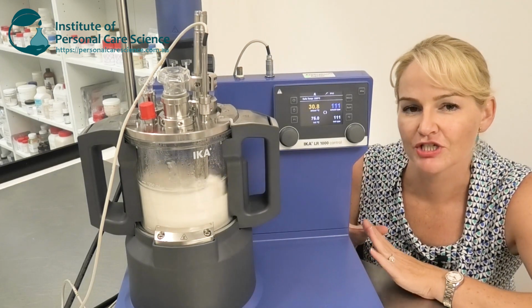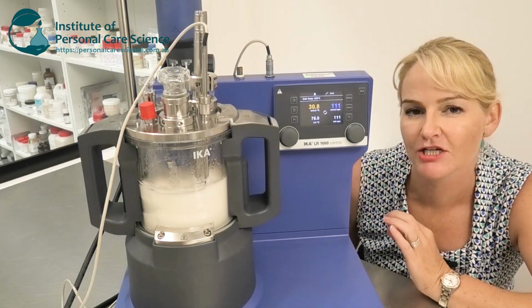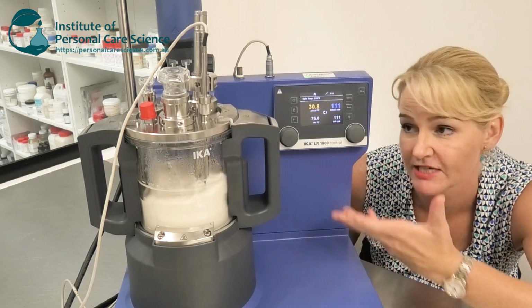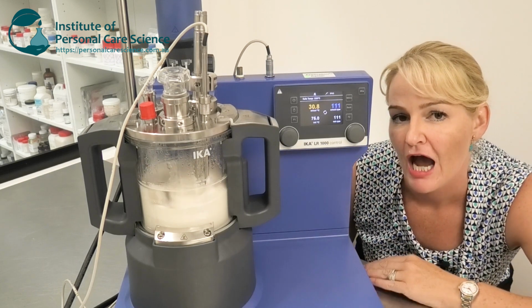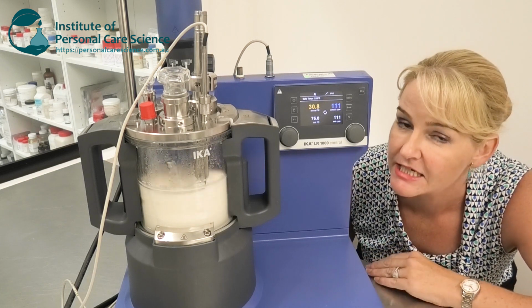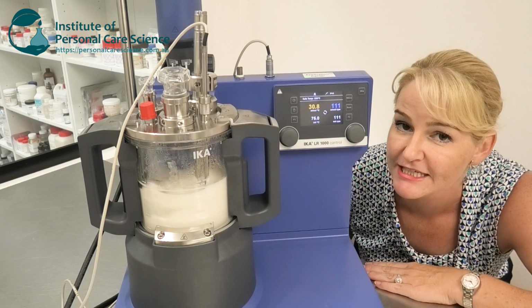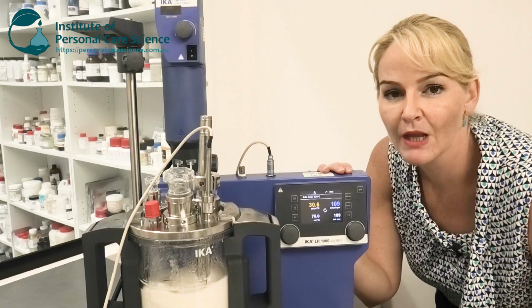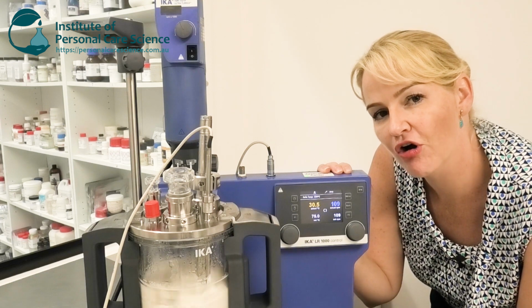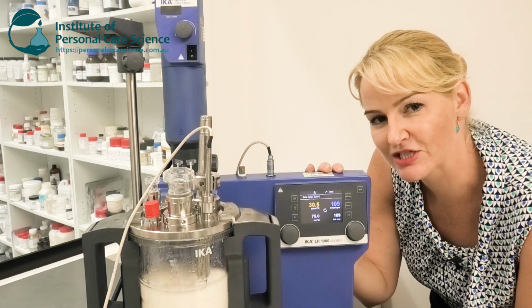Now, as I mentioned, when I want to check pH, you can actually get a probe that fits into this machine, and it will even just test it while it's stirring. I haven't got that option on this particular machine, but I can easily test pH by removing the lid and testing it the normal way. There's a great safety feature in this machine that if I try to lift the lid off while it's stirring, it simply stops.